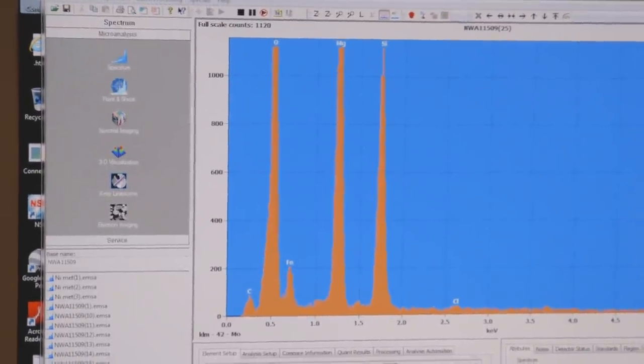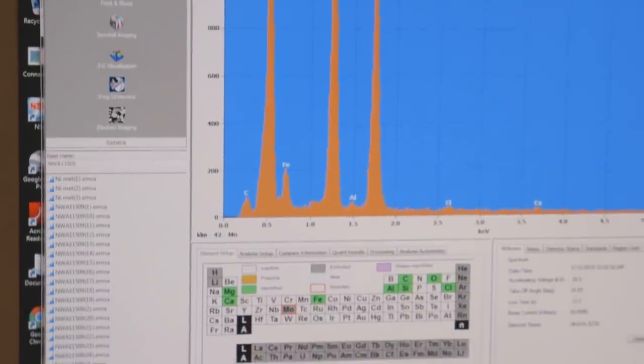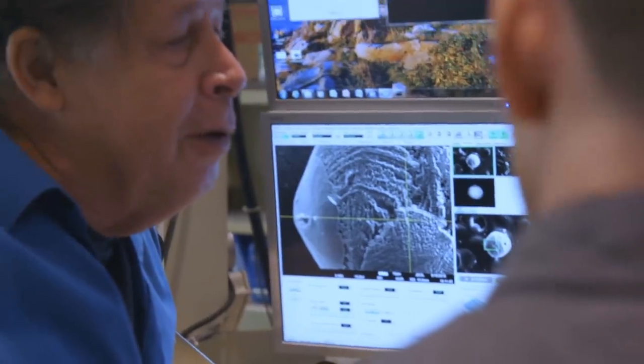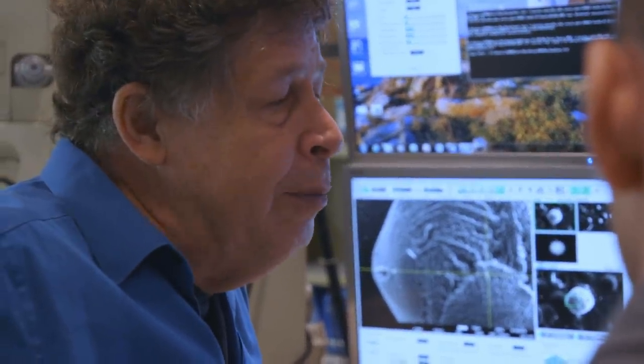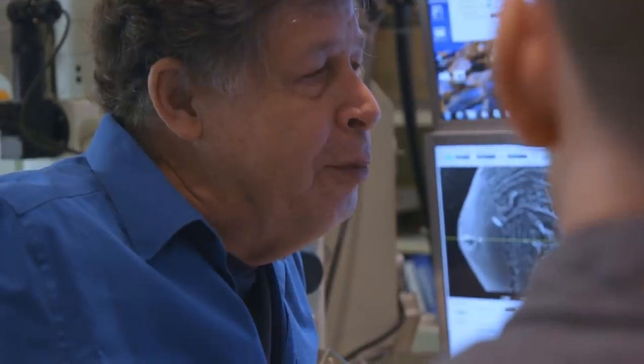But what really tipped the scales? The probe's readout showed lots of magnesium mixed with a little silica. And that's telling us this is another mineral called olivine, which is the most common mineral in the solar system, probably. And this is in almost every kind of meteorite and micrometeorite that I can think of. So this pretty much nails this as being a micrometeorite.